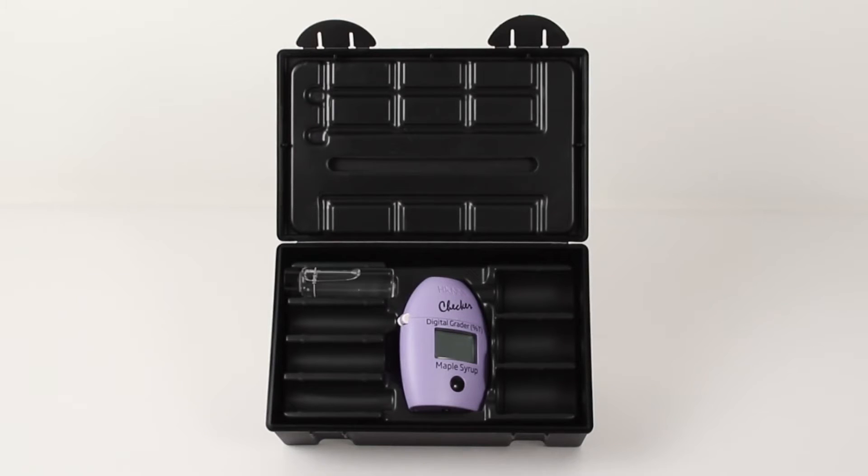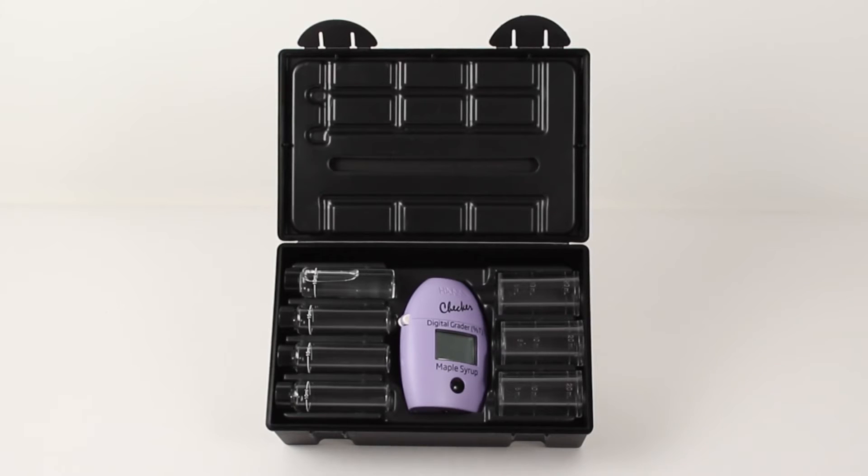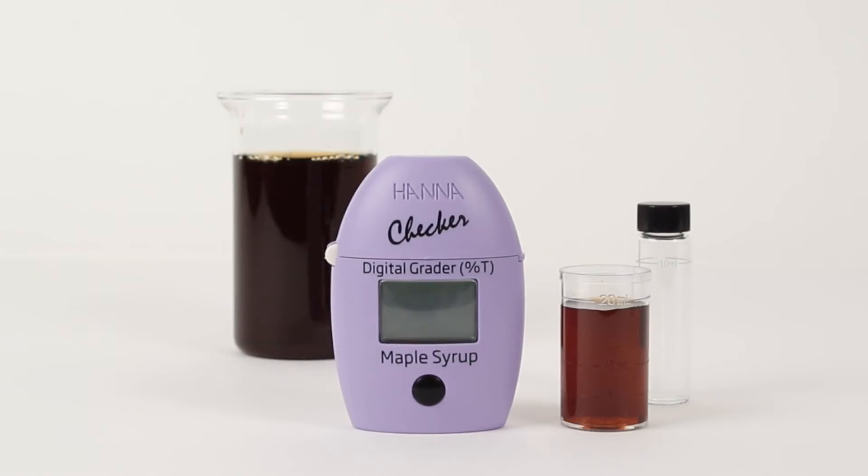With a digital grader you're supplied with everything you need for a successful measurement: a sealed standard glycerol reference cuvette, which calibrates the meter to 100% transmittance; three sample cuvettes with caps, which are what you pour your maple syrup samples into; and three small beakers, used to pour your syrup into your sample cuvettes.